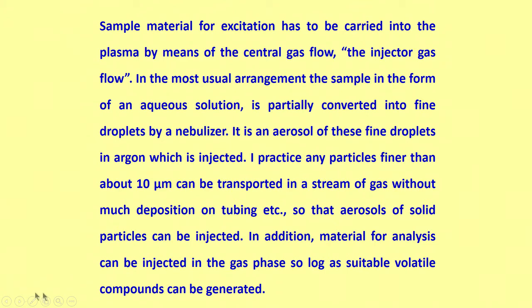One way is for the sample to get sucked into the system using the argon flow itself, or to use a peristaltic pump to introduce it into the plasma torch.